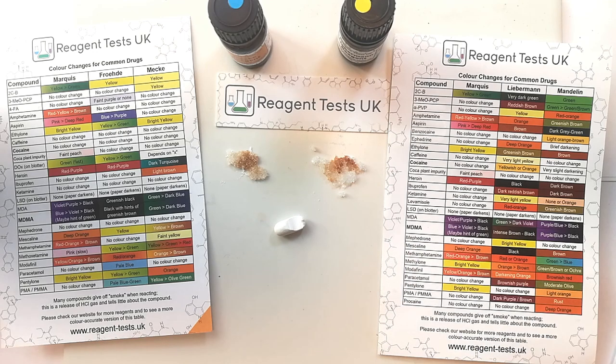So that's how to use the solid reagent tests. If you've got any questions, please do contact us. We're always really happy to help people use the tests and to interpret their results. Thanks ever so much.